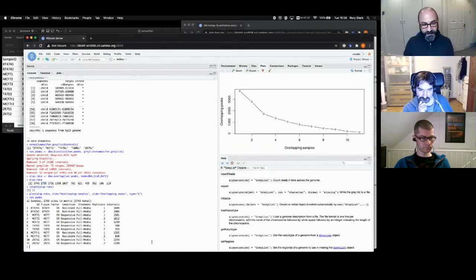There are more advanced ways of doing this. For instance, we could come up with a separate consensus for each of our cell types and then merge those. Say, I want it to be in 2 out of 3 of my replicates, and then take the union, things like that. These are in the DiffBind vignette, where we go through some of the more advanced ways of generating consensus.